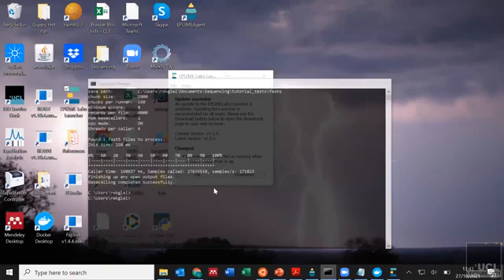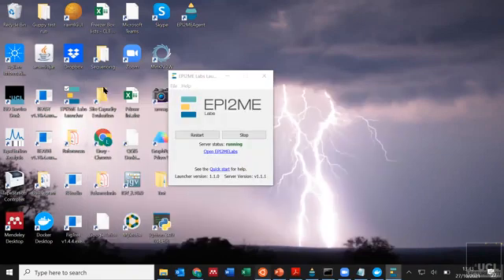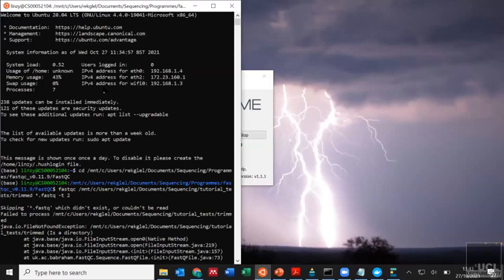I've now also got Ubuntu, and obviously you can only use certain programs with Linux. So Linux and Mac OS are much more similar, and I think Sylvia, please correct me if I'm wrong. Most of them, if they run on Linux, you should be able to run on a Mac, but Windows is more different.